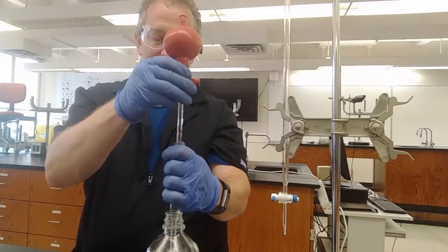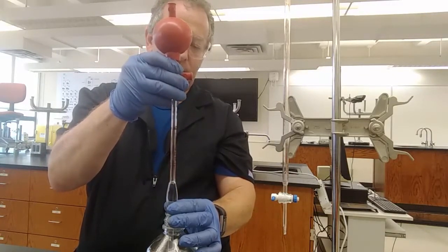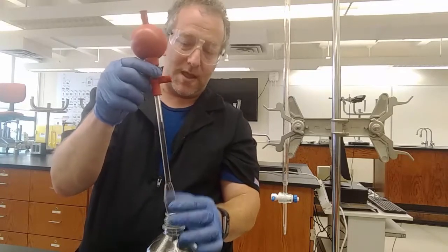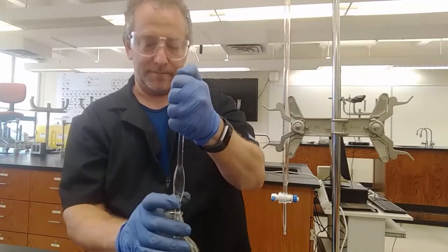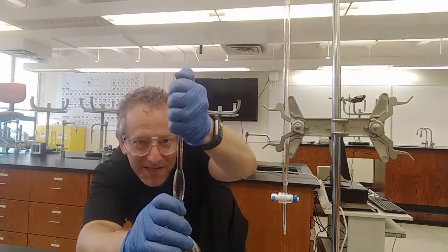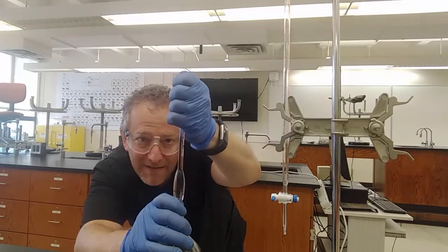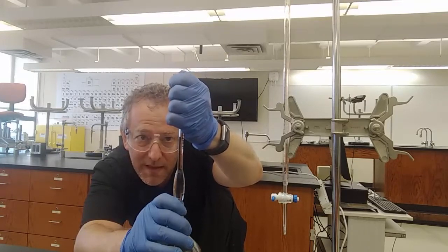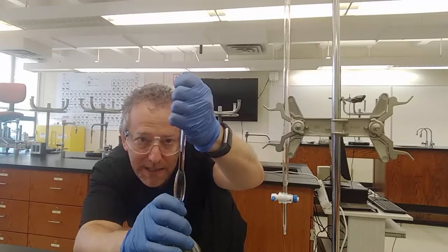Gently on, suck up past the TD line, but not into the bulb, which would contaminate everything. I'm going to go old school this way and use my finger to get down to the line. Removing that bulb and getting my finger on the top takes a little practice. Then I rotate my thumb off the top a little bit so that, even more slowly than with the pipette bulb, I can get the meniscus exactly on the TD line, which on most pipettes is the only line, because most pipettes are just marked TD.